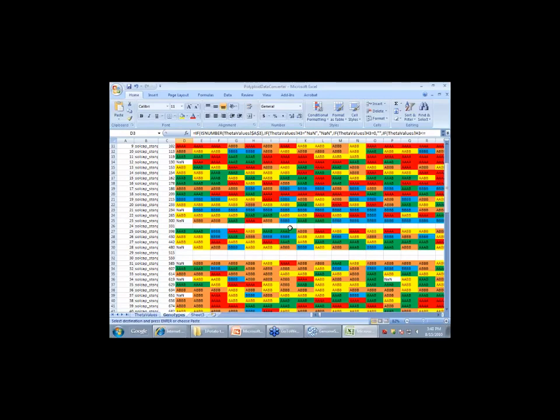They're going to export the files you need for Genome Studio, or export genotypes, depending on how close you are with that lab. Right now, the only genotypes they're going to export are the diploid ones, so you'll be limited to that. You have to buy Genome Studio, unfortunately, to be able to play like we just did. But if you have access to a lab that has Genome Studio, you can do that.